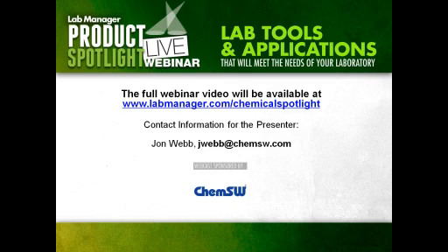Well, I think doing more research on that specific material is going to be absolutely necessary. And keep in mind, as I was describing within the presentation, the way a best-in-class system should be set up is to have the material level information captured, which is all the informatics about that specific material. Once you build that one time, anytime you receive more containers of that material, you're always going to have that high-level information persist.